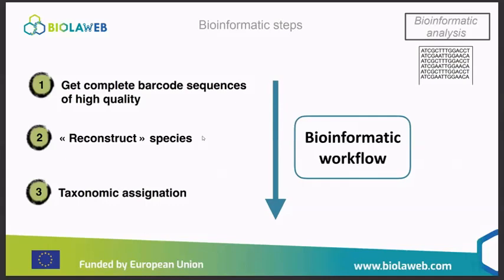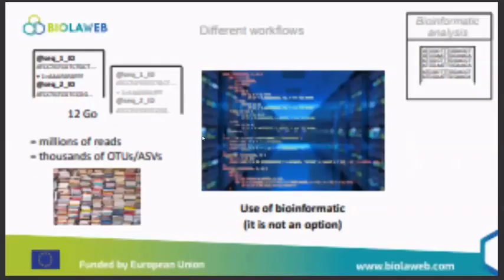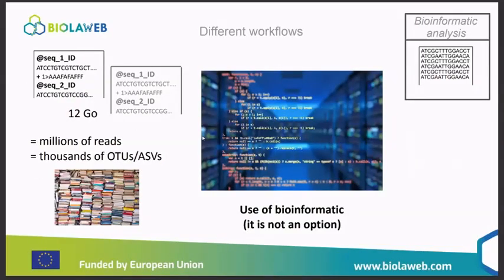So all of these steps compose a bioinformatic workflow, because you have to deal with millions of reads and thousands of OTUs, for instance. So you need to use bioinformatics, and it is not an option, or you will pass years analyzing your data.